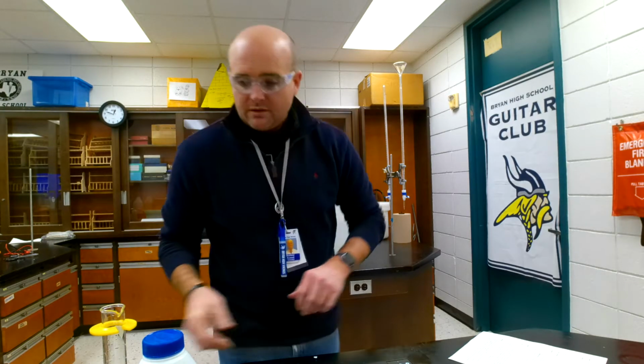Well, if you remember, the absorbance is directly proportional to the concentration, and it's related by the path length of the cuvette, and it's also related by the molar absorptivity of the sample. So assuming that the molar absorptivity and the path length remain the same, the concentration and the absorbance will still have the same relationship. So the absorbance will be on the y-axis, even though typically in our classroom setting, concentration is on the y-axis. So let's get ready to do this.